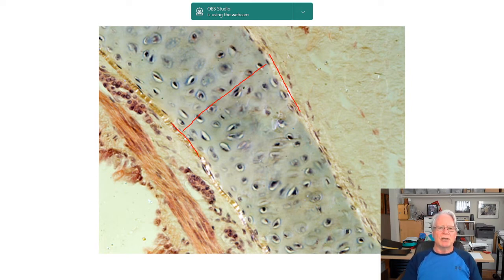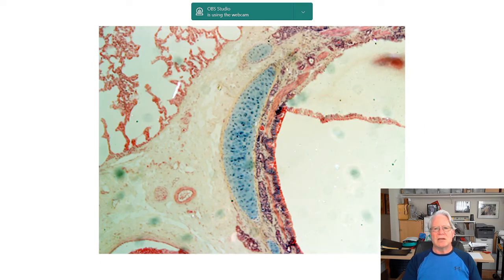Okay. I will talk about this later on, but this right here is smooth muscle tissue. Okay, so there's my capsule. And within that capsule, you have the cartilage. This is epithelial tissue that's been pulled away from here. So it's been pulled in this direction. And this is the trachea, actually, because the trachea, as you'll learn, has about 16 to 20 C-shaped pieces of cartilage that hold the trachea open. This is the inside of the lung, so this is simple squamous epithelium.